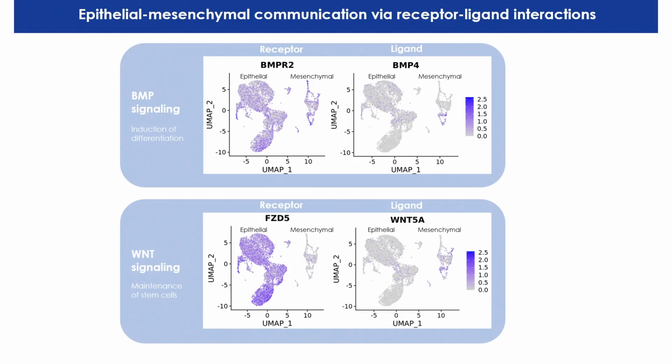So this data suggests that it might actually be beneficial to preserve the mesenchymal cells in your system, just like we do in the gradient situation, as they might have a supportive role for the epithelial cells, just like in our own intestine.